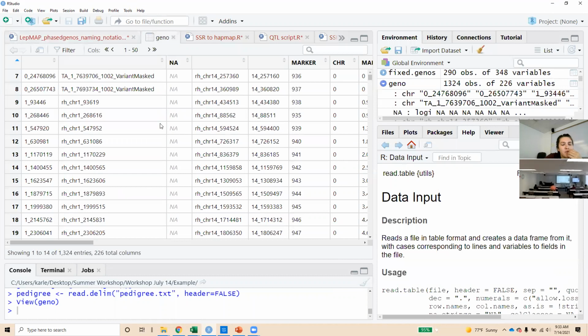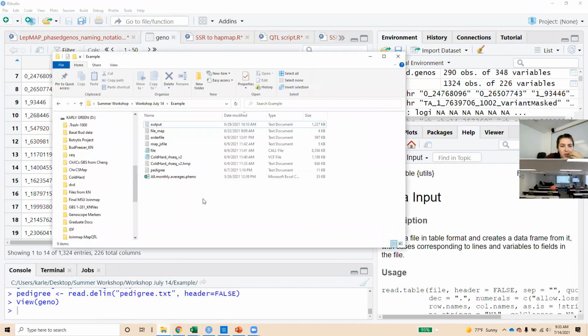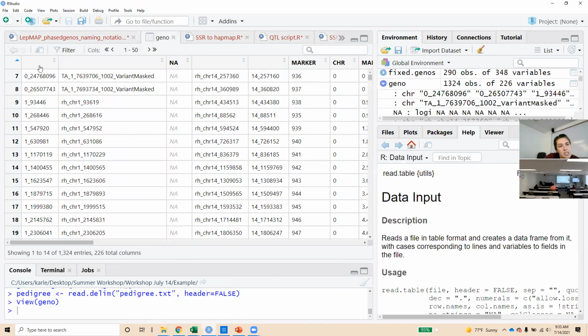I copied the folder that I used for the last workshop, and so this output file actually has some edits in it. It doesn't look like it's supposed to. We'd run into issues with this file because row 1, column 2 has this stuff in it, but we're actually trying to assign information to this cell. That's why it's important not to edit.